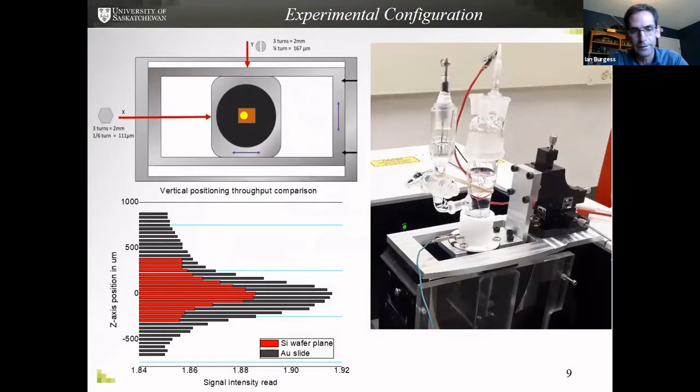We also found out that using the laser system, the focus was much tighter than we were used to with a conventional source. And this meant that our latest generation of the experiment requires the 3-axis positioner to hold the spectroelectrochemical cell, because the throughput is just incredibly sensitive to the exact position of where your sample is. So once we worked through a couple of those bugs, we were ready to go, and we were able to do some spectroelectrochemistry.